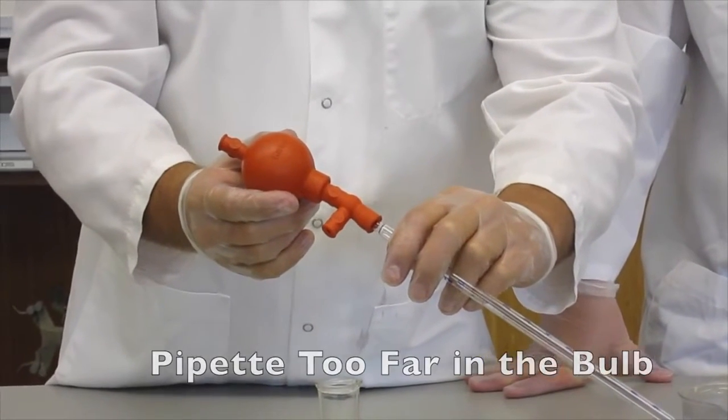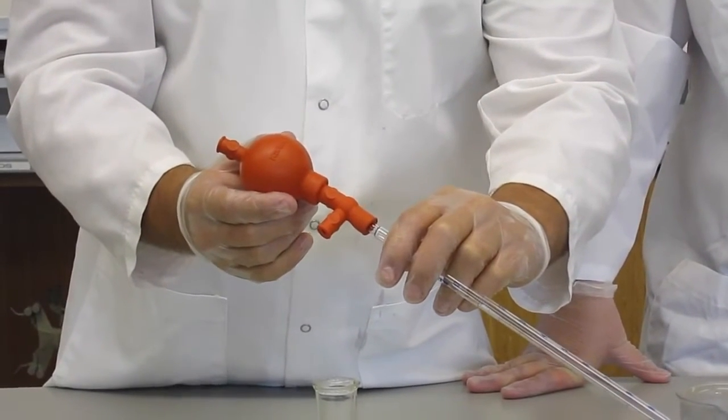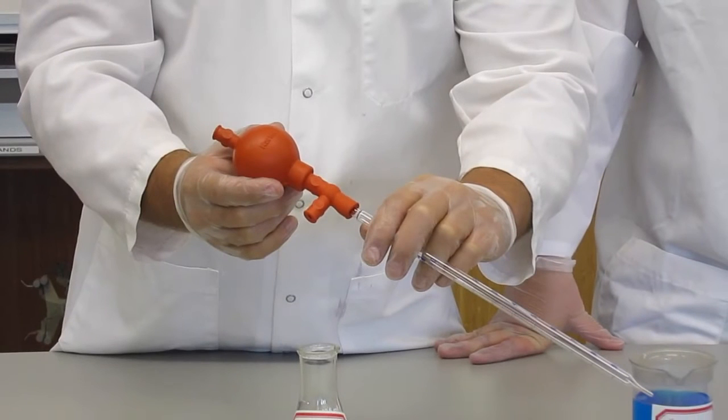When a pipette is pushed too far into the bulb, it blocks the eject valve, not allowing you to dispense your liquid. To fix this, pull your pipette out a little bit, removing the obstruction.